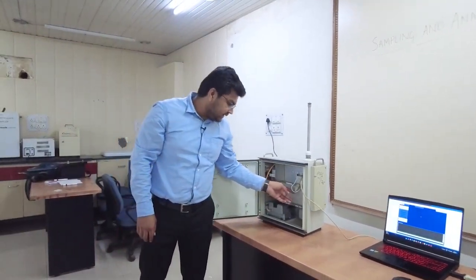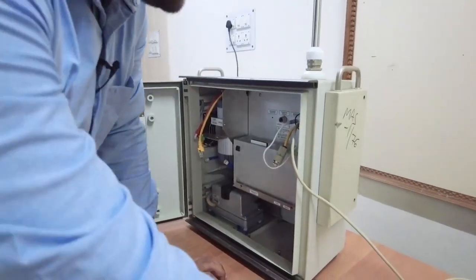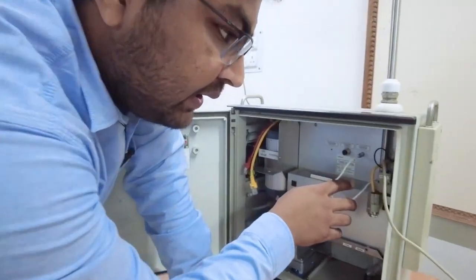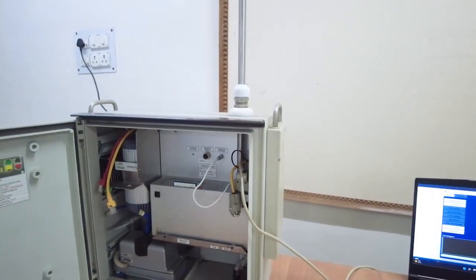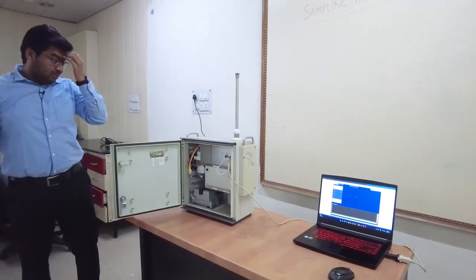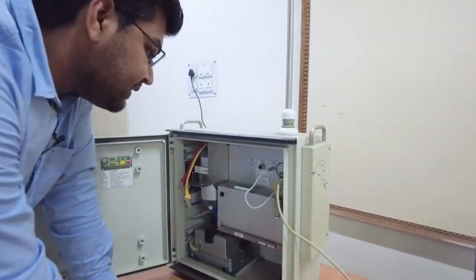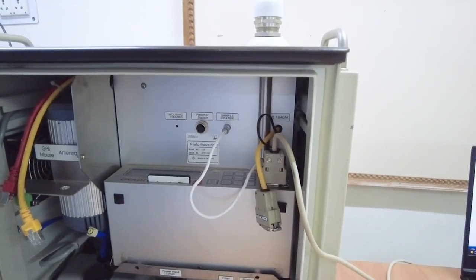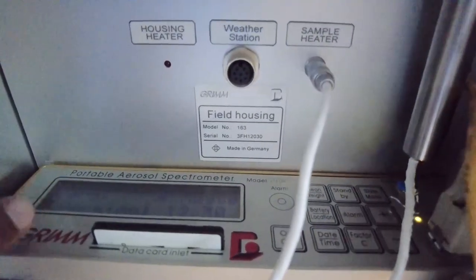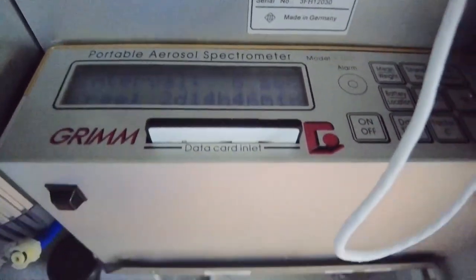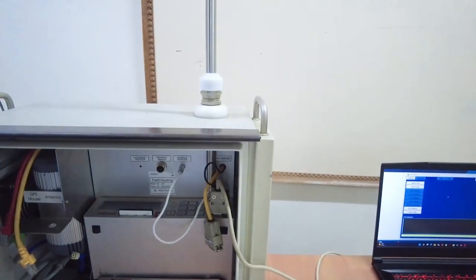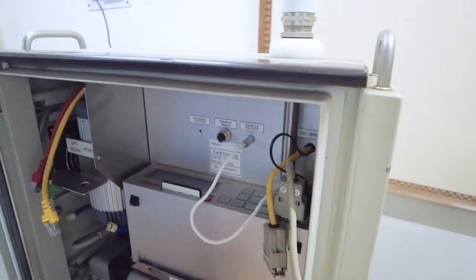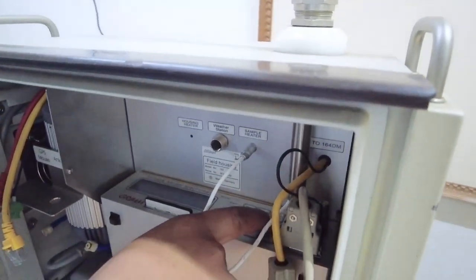The spectrometer is fitted in the field housing and connected to the system using the RS-232 cable. The sample pipe is placed in the sample inlet port shown earlier. When you turn on the system, the LCD screen first displays the model name, then the date and time, and then the available memory showing how much duration is available for measurement. After that, it will ask whether you have changed the filter. In response, press the plus button on the spectrometer for a few seconds.